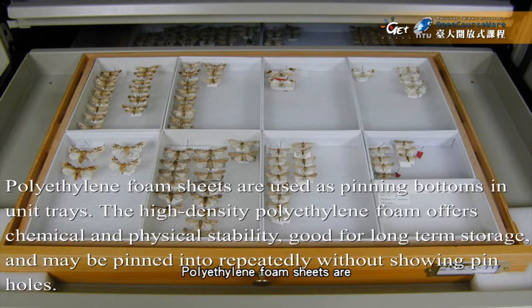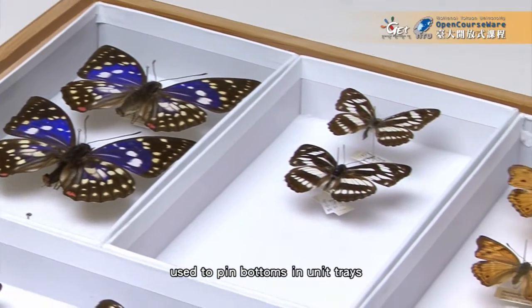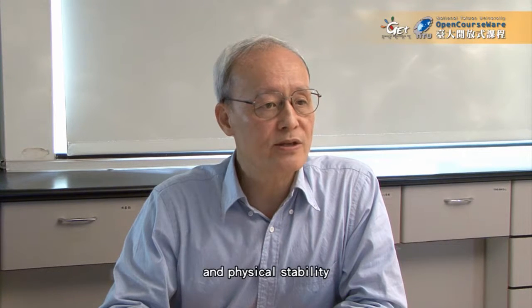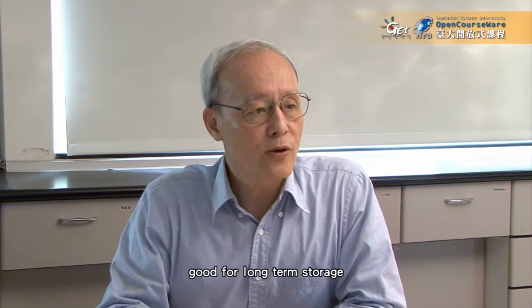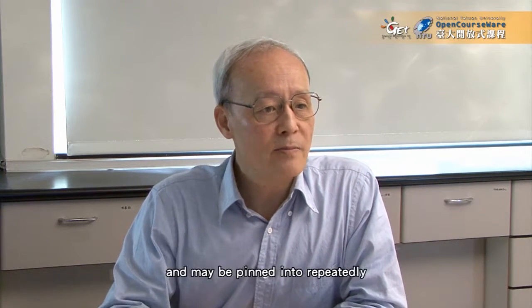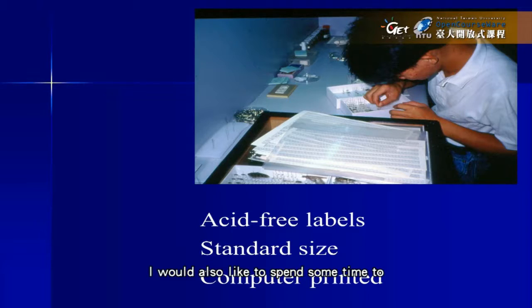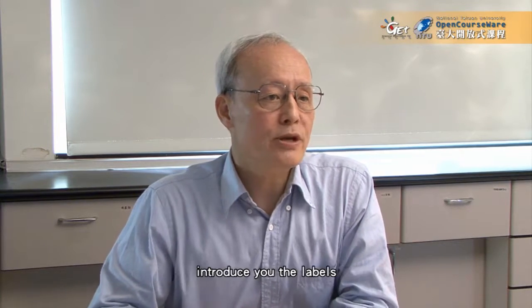Polyethylene foam sheets are used as pinning bottoms in unit trays. The high-density polyethylene foam offers chemical and physical stability, is good for long-term storage, and may be pinned into repeatedly without showing pinholes.